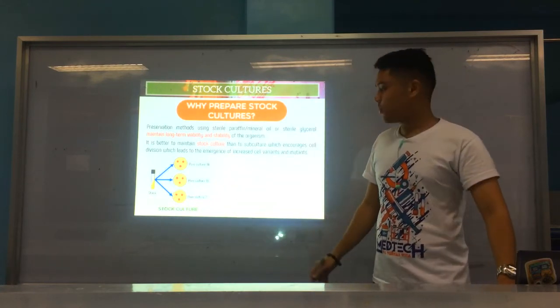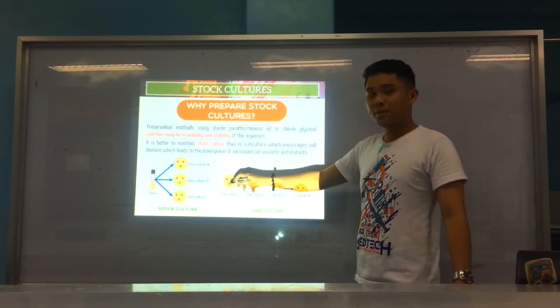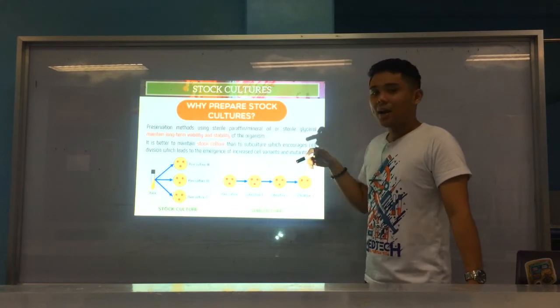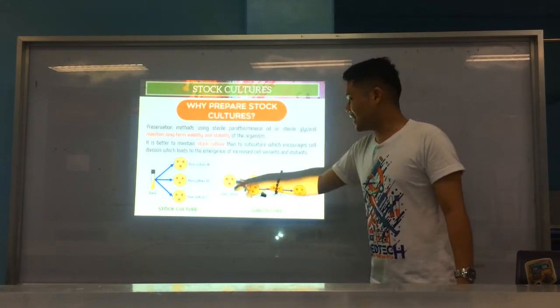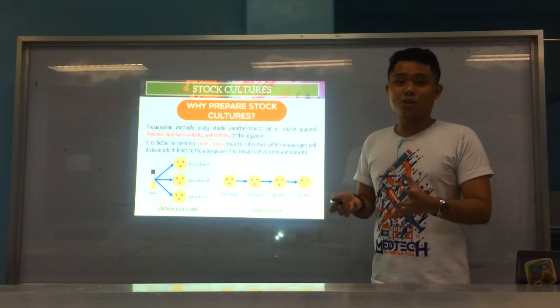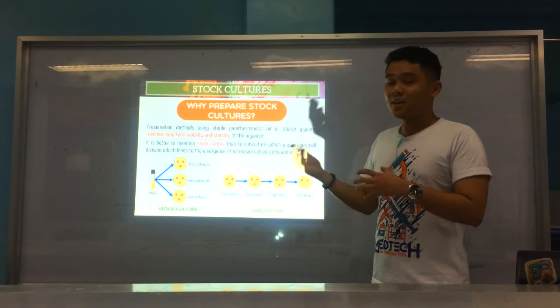Now, in comparison, if usara yung plate, and then masili kang subculture. So, example, pure culture nimo, and then subculture ka, and then from here, another subculture, and what this scenario promotes is cell division or mutation of your bacteria here. And cell variants and mutants.